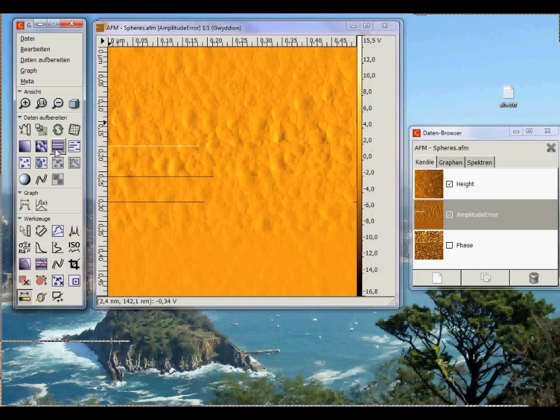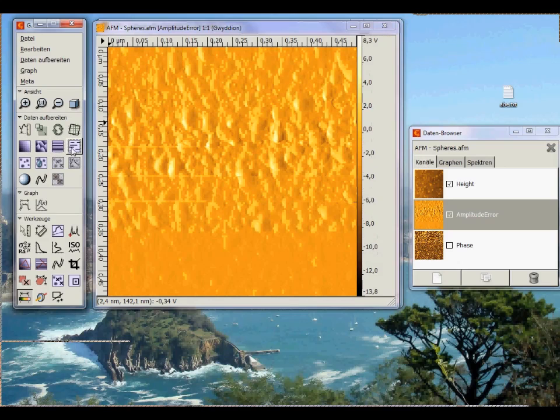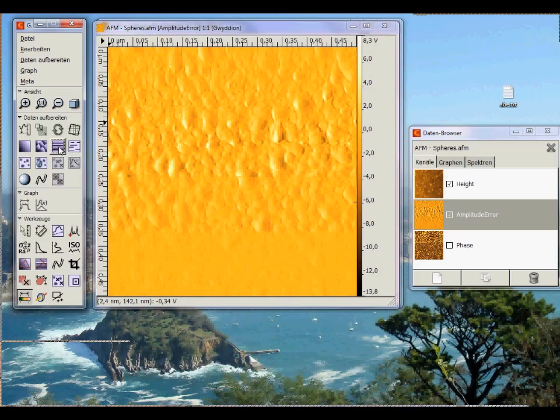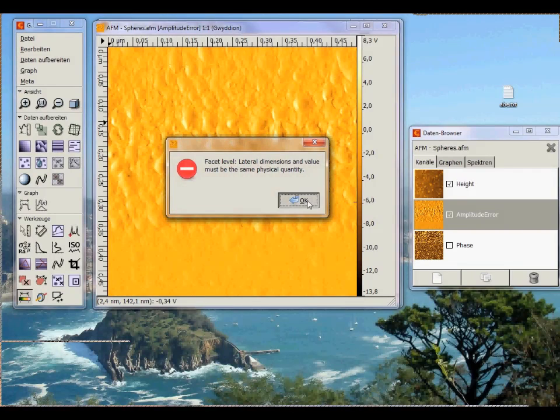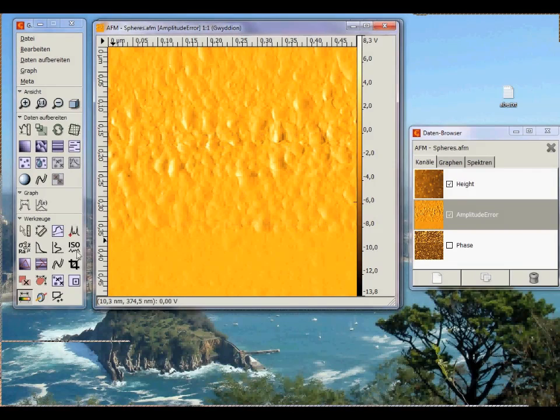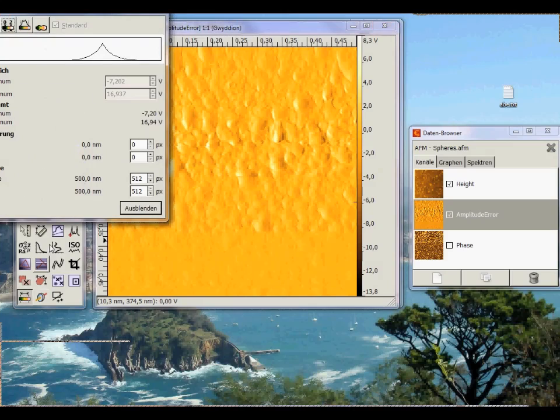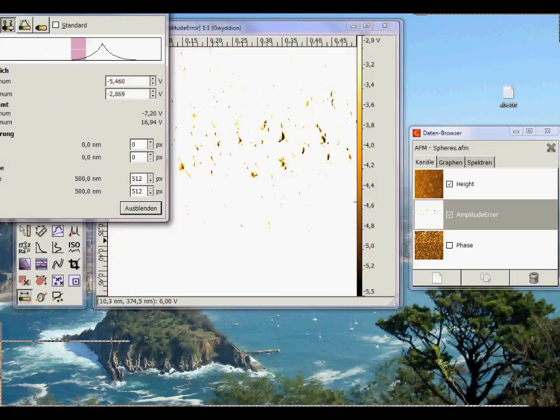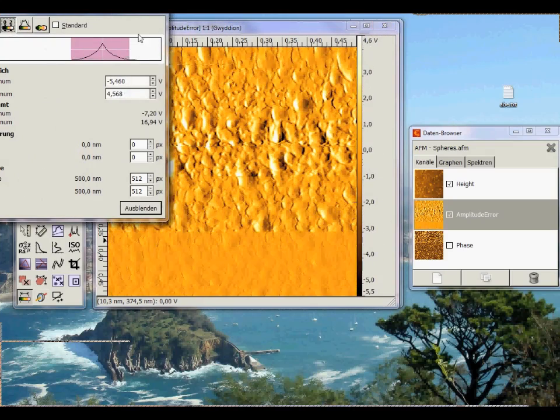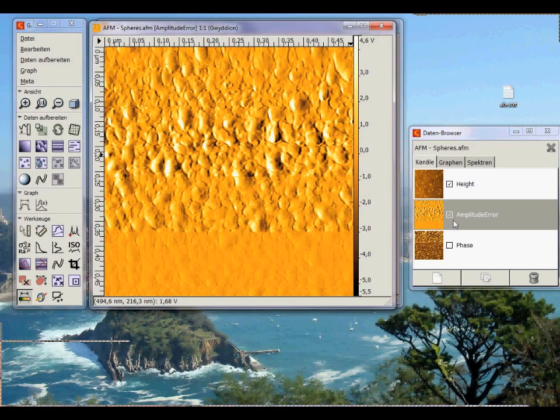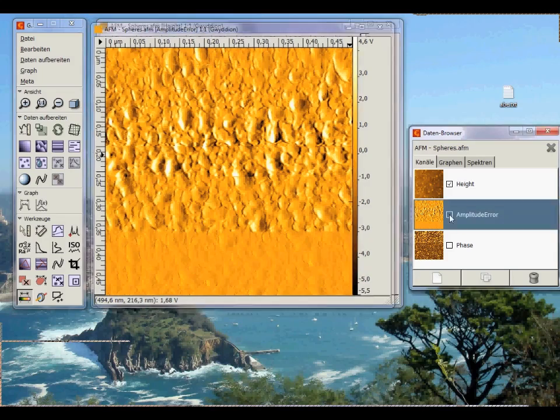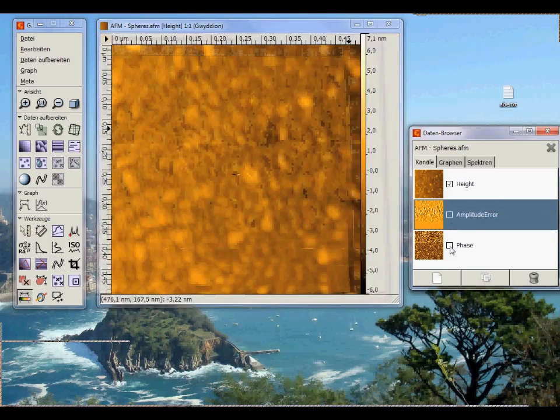Now I apply the standard flattening and remove the faulty lines. Then I adjust the data scale and now let's take a look at the phase of the image.